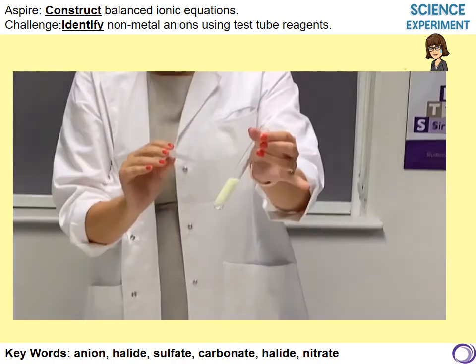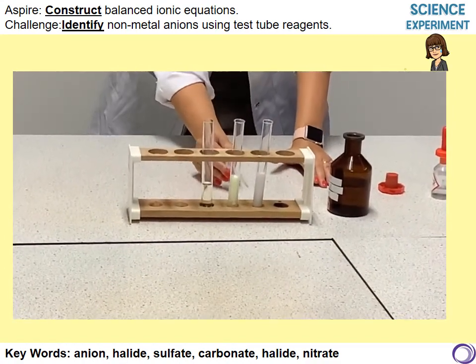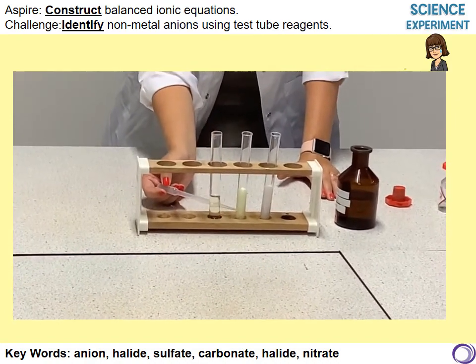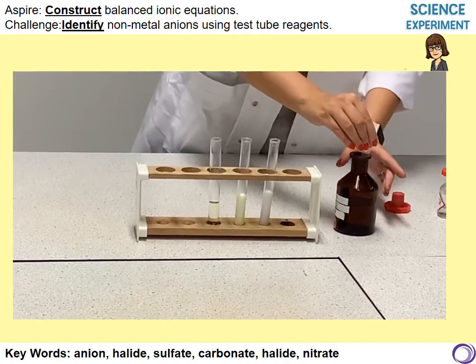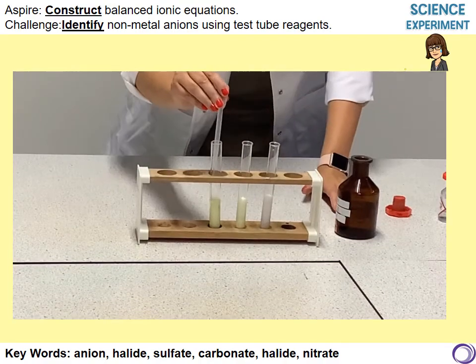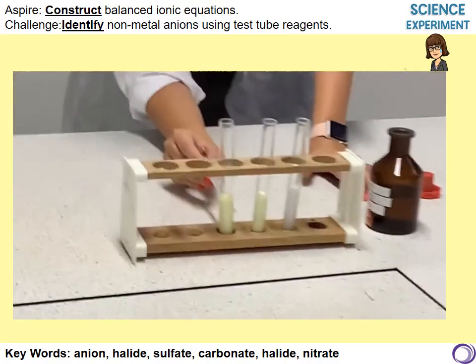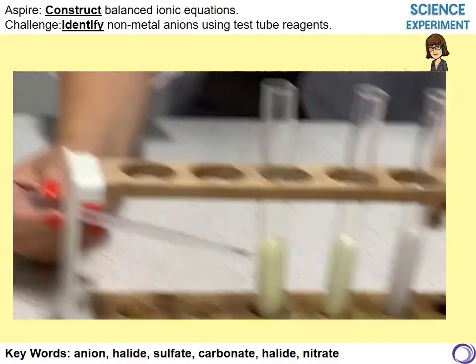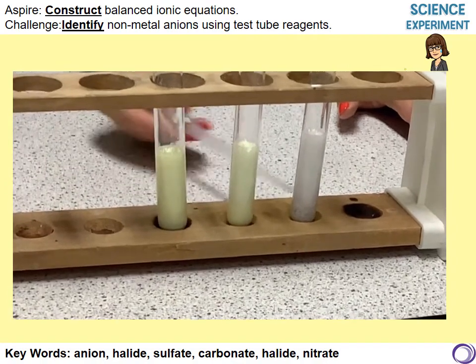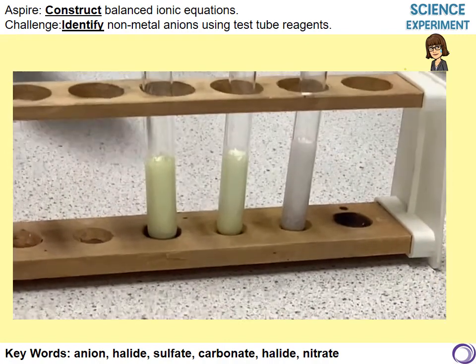Now it is very pale, so I'm going to put it next to the chloride and you should see that it's slightly darker and we say that this is a cream precipitate. So now let's add some silver nitrate to our iodide ions and again we can see a precipitate has formed. It is slightly darker than the bromide precipitate and it's more yellow than it is cream. So that is the test that I can do to identify my different halide ions.